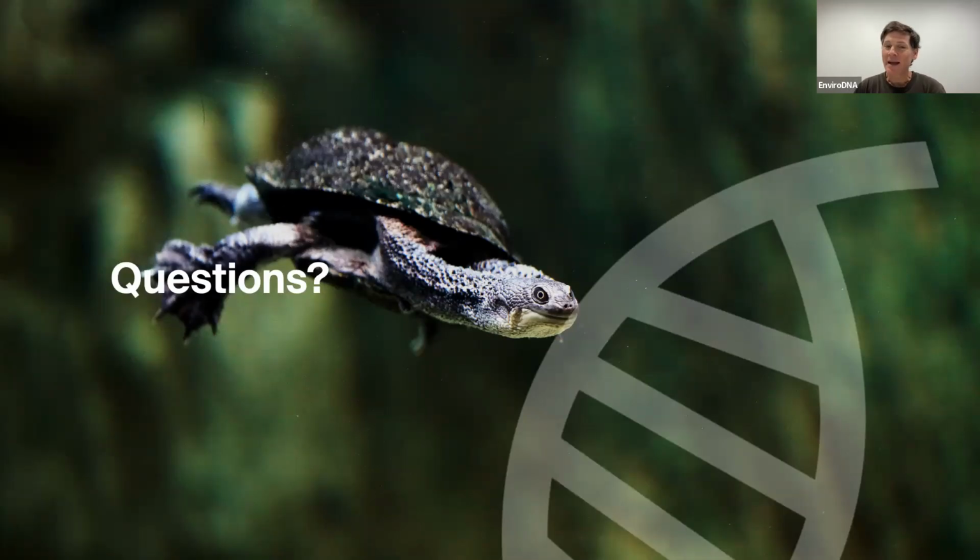But you can imagine, and you don't have to imagine, you can read about it, that these things vary with everything you can imagine. So the species itself, its size and its shedding rate, so therefore its behavior, which will vary seasonally as well as environmentally. pH of water, for instance, all of these things change degradation rates as well as shedding rates. So it's kind of inputs and outputs.